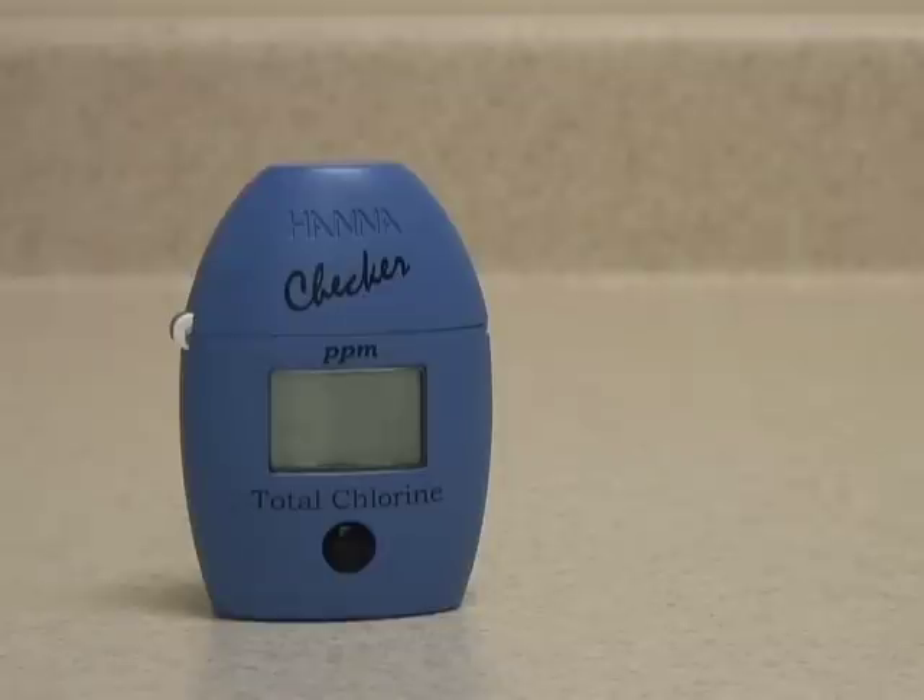The reaction time has now elapsed and the meter is analyzing the sample. It is now displaying the readout in parts per million total chlorine.